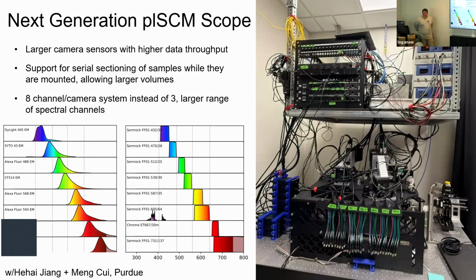But that is basically the same as a nice confocal from any of the big manufacturers. Yeah, the hardest part about it is really just the day-to-day maintenance that's required compared to a commercial system. Commercial systems are usually engineered so that you can have it installed and let it run for 10 years. And if you don't spill anything on it, it'll probably survive. This requires a lot of upkeep of the mirror alignment and that sort of thing, just because of it being an open system, right?